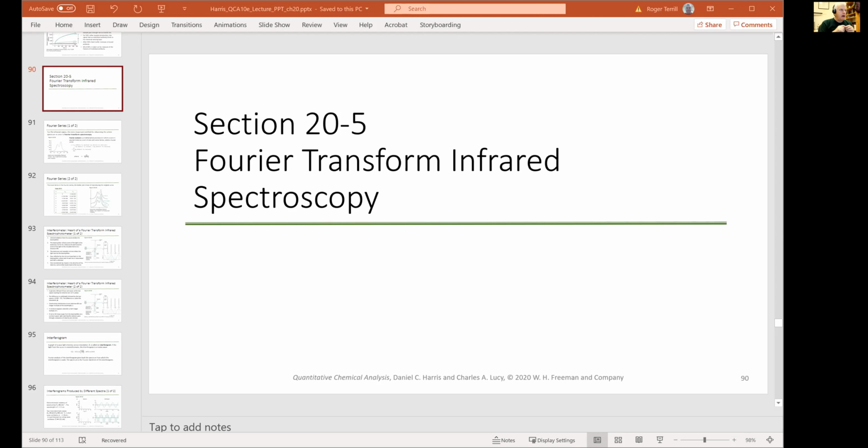So what that means is it'll take 3,000 wave numbers, and that might be 10 kilohertz, 10,000 hertz. And 10,000 hertz is something that we're very skilled in dealing with. These types of frequencies we can manage. So let me draw a little picture for you.